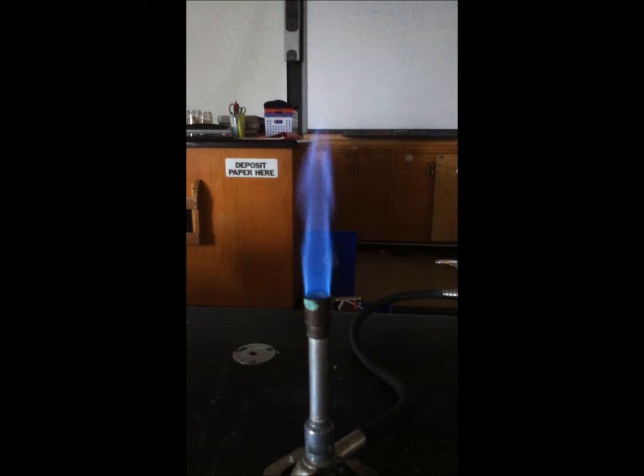Maybe we'll try the top of the flame and see if we can get something similar as well. The camera makes it a little bit difficult to see. There's kind of the purple color — put it on the side again — and hopefully you can see the light purple color there.